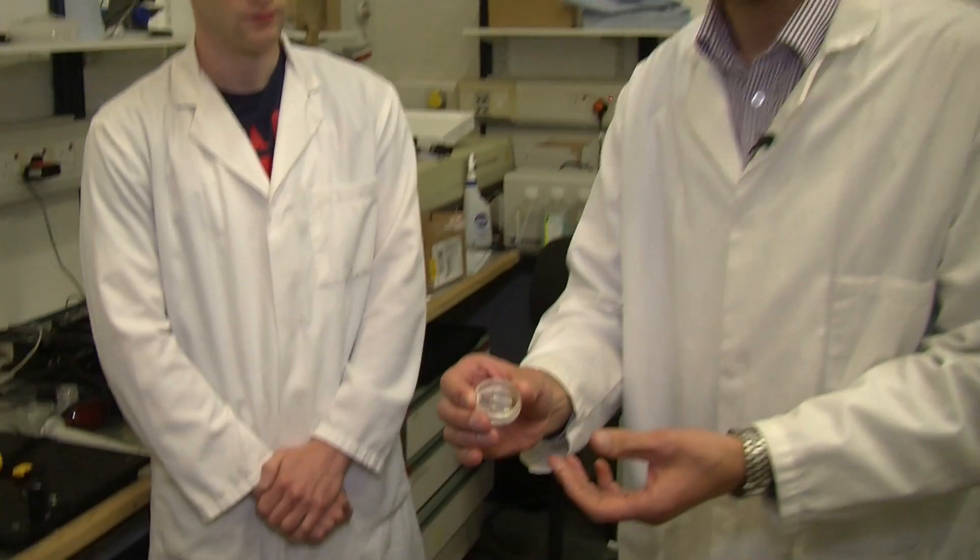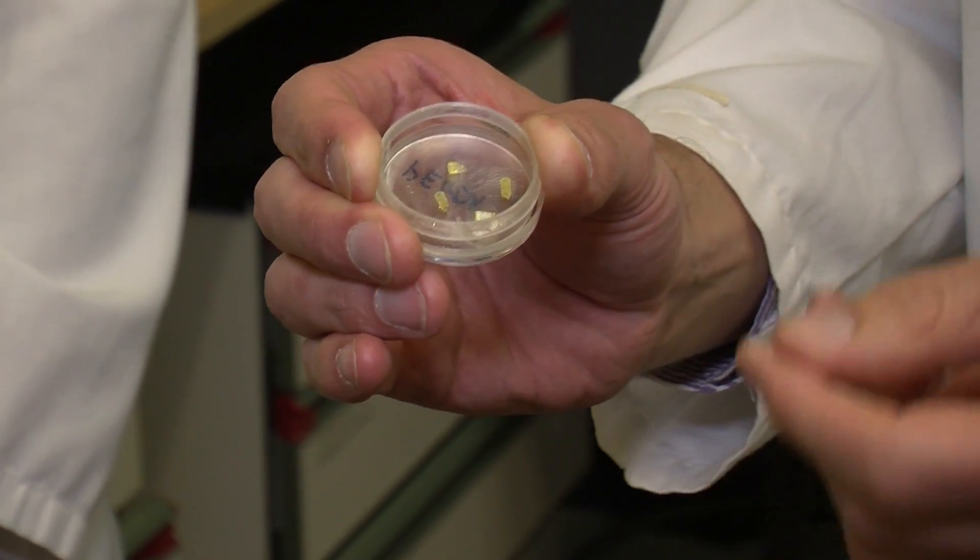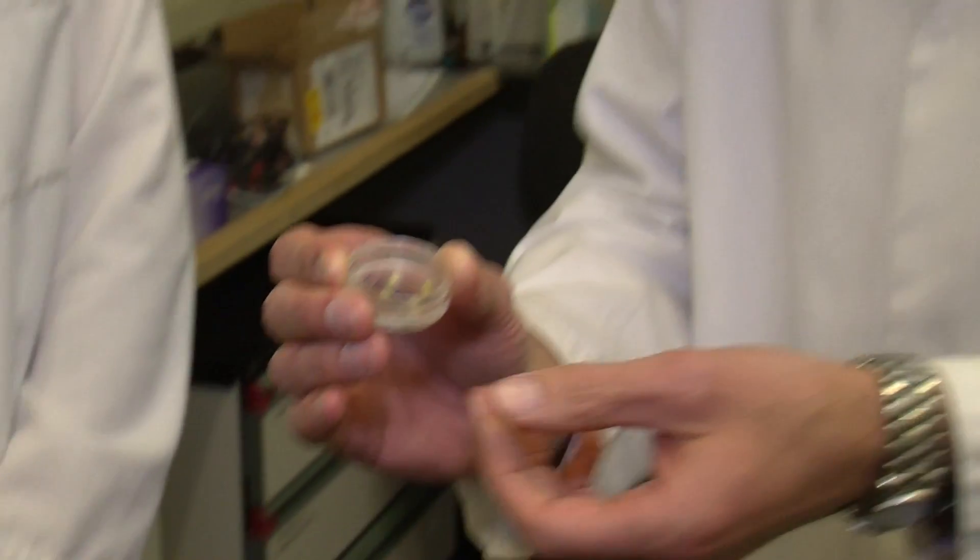We're in a micro stereolithography laboratory. The lithography apparatus enables us to make these nerve guide devices. This technique is very attractive because it uses ultraviolet laser light - you shine that light onto your synthetic polymer, this polycaprolactone, and it can convert a liquid to a solid, but it's a 3D fabrication technique. We can actually make our tubes, and in addition to making the tubes, we can also make these intricate structures inside the tubes. Some of the little devices we've made very recently are of a clinically appropriate size - the diameter of these tubes is about one millimeter and the length of the tubes about six millimeters. These would address small nerve gap injury models.